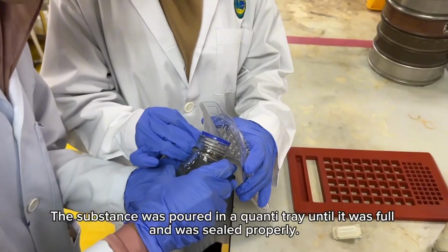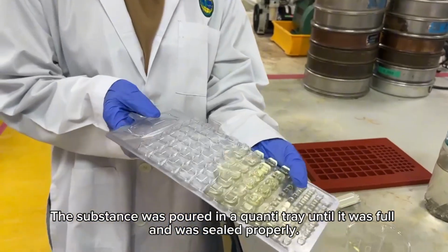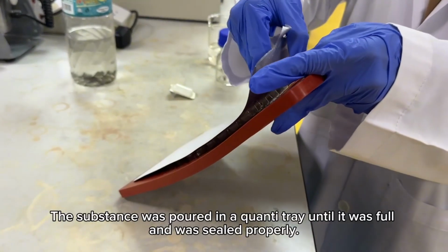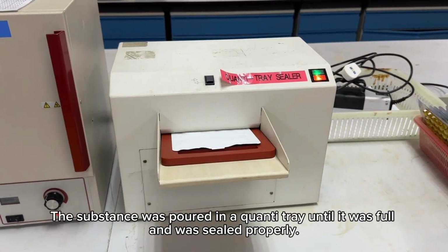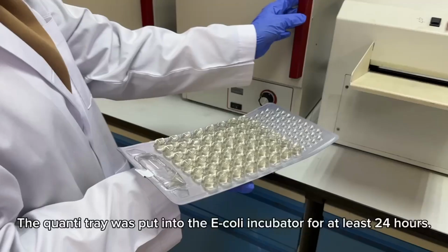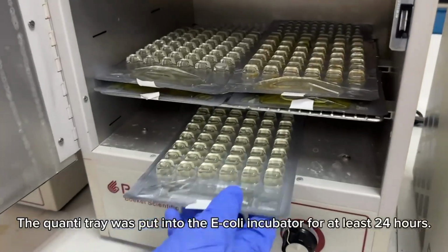The substance was poured into a Quanti-Tray till it was full and was sealed properly. The Quanti-Tray was put into the E. coli incubator for at least 24 hours.